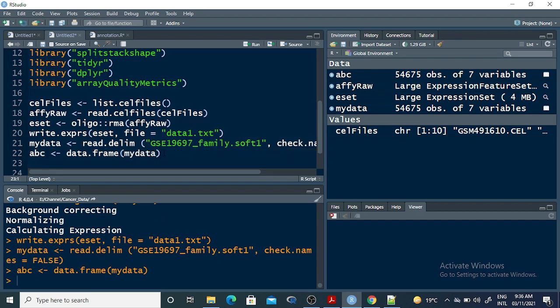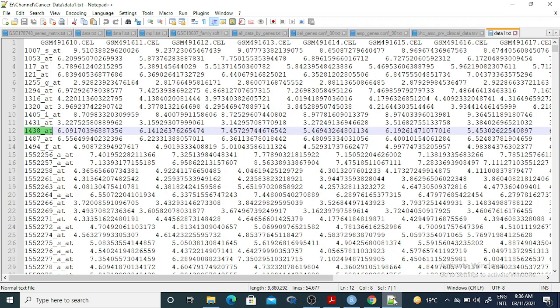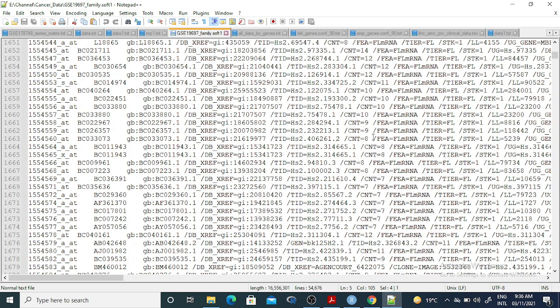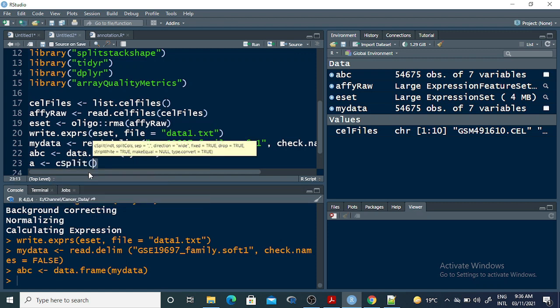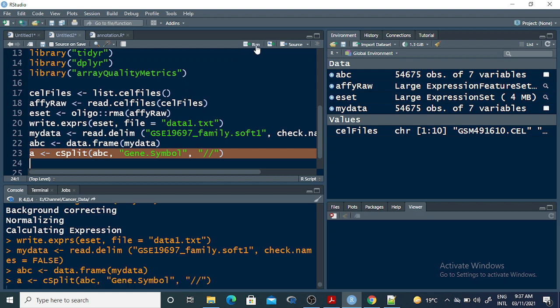Next, I need to split the gene symbol column because there are extra slashes before some gene names. I want to produce a single gene symbol value per row. I use the cSplit command from splitstackshape: cSplit(abc, 'Gene.Symbol', '/') — this splits all values in the gene symbol column by slash so each value becomes a separate row.